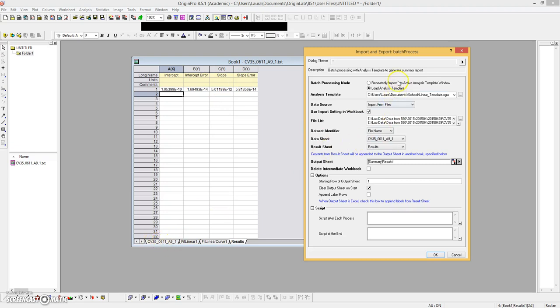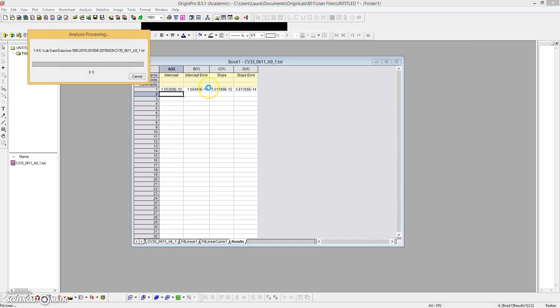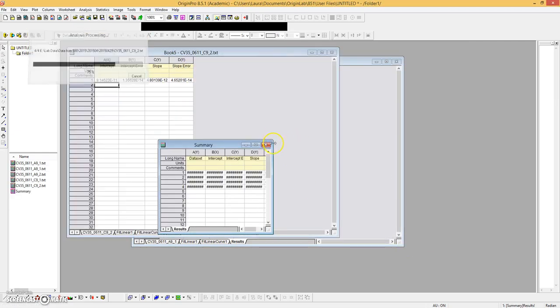Okay, and everything looks good. Let's go ahead and press okay. It's going to take just a little while to do it all. And done.